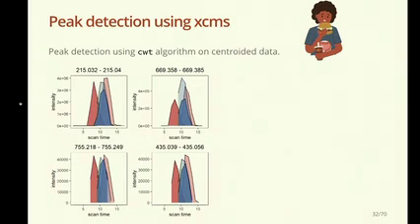So you can see here an extracted ion chromatogram for 4 randomly selected features, not randomly but informed. And you can see that in about half of the cases, the peak shape is ill-defined, like it's kind of cut off, and it's not the nice Gaussian profile that we expect from a chromatographic peak, which is in part also because it's a very sudden increase in ions that happens. It's not a more gradual increase in ion intensity as in a chromatographic separation. And of course, the number of scans is also very limited. It's a very short sample measurement time.